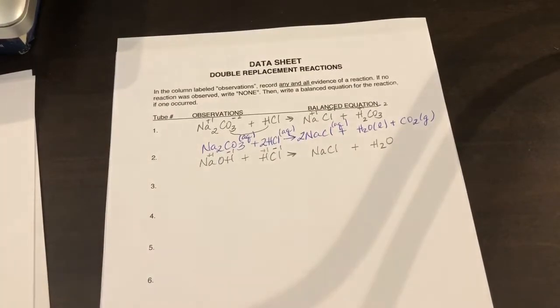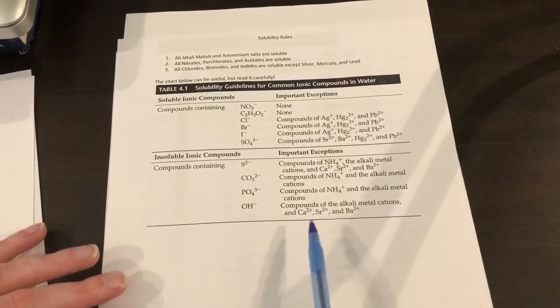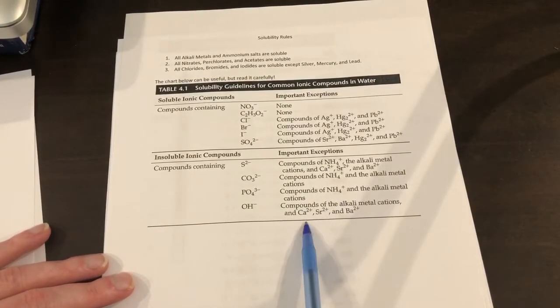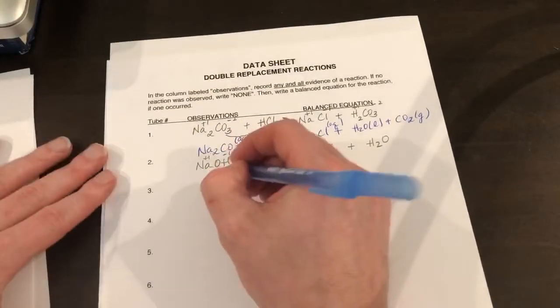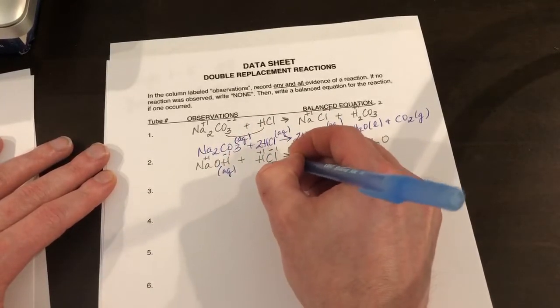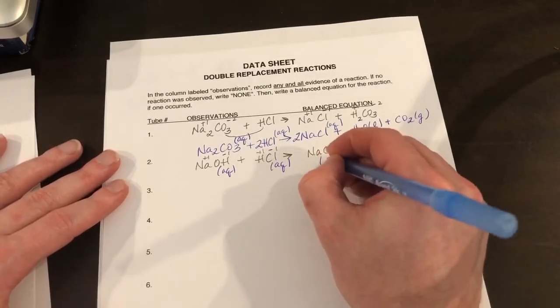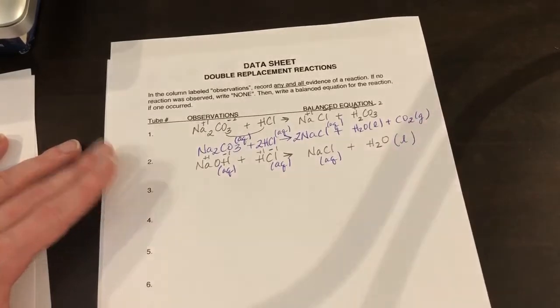Rules for hydroxides. All hydroxides are insoluble except for group 1, calcium, strontium, barium. Sodium falls into that exception, so it's soluble. Hydrochloric acid is soluble. All compounds containing chloride are soluble except for silver, mercury, lead, and we're going to form liquid water out of that.